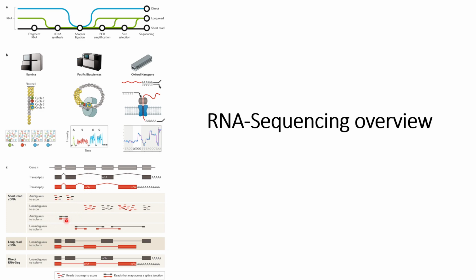So these are the ambiguous isoforms, and these are the non-ambiguous isoforms that software can detect. However, in the long read, since the complete cDNA is analyzed, the whole isoform can be deciphered with more accuracy, and there will not be any ambiguous region in the case of long read cDNA.